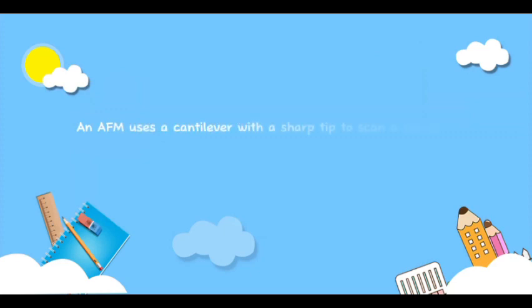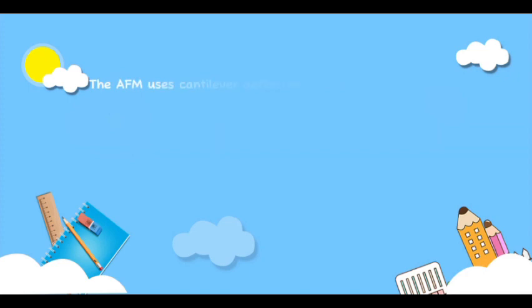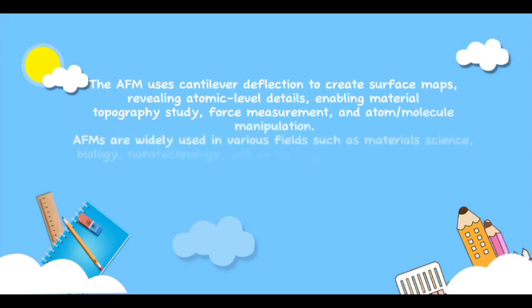An AFM uses a cantilever with a sharp tip to scan a sample, bending due to forces between atoms or molecules, detected by a laser and reflected onto a photodetector. The AFM uses the cantilever deflection to create surface maps revealing atomic level details, enabling material topography study, force measurement, and atom or molecule manipulation.